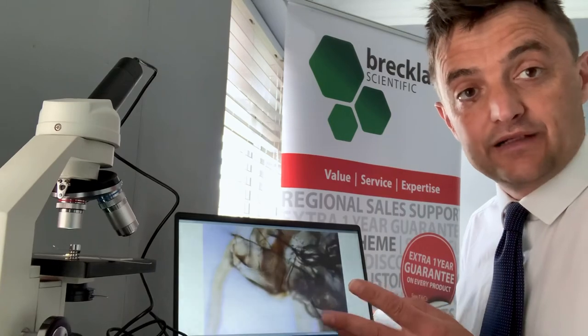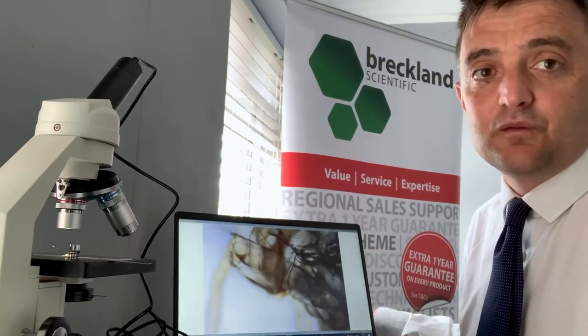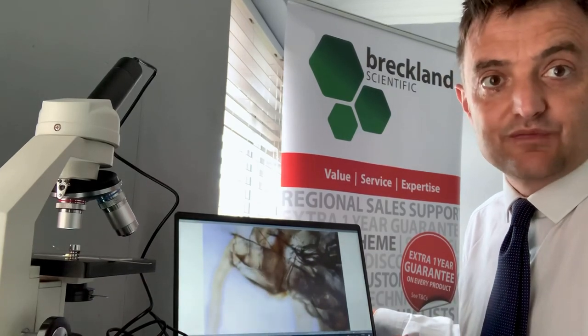Have a look at it in our catalogue - you're going to be amazed at the price you can get these for. It's the Kern eyepiece camera, available in 1.3, 3, or 5 megapixel versions.